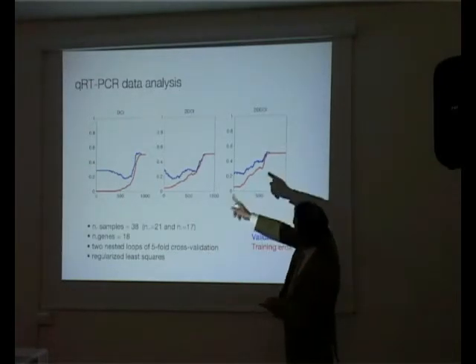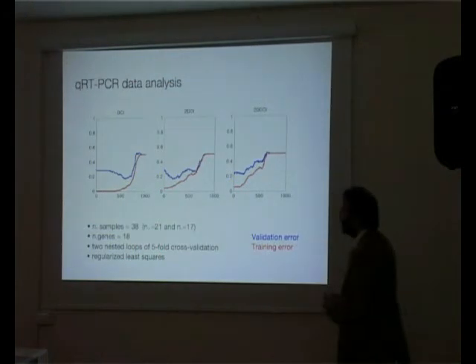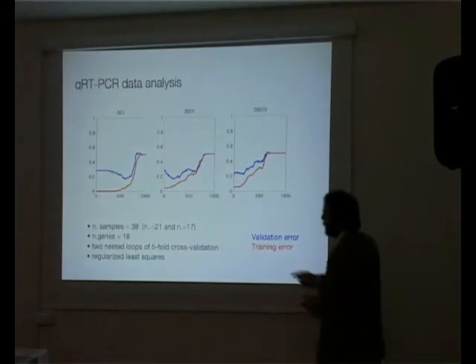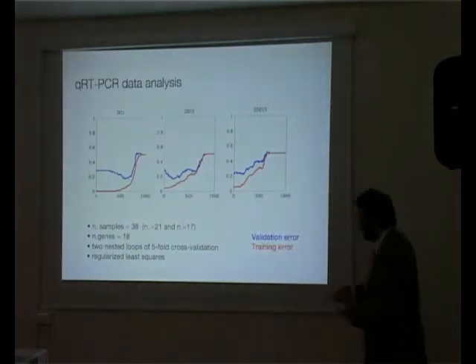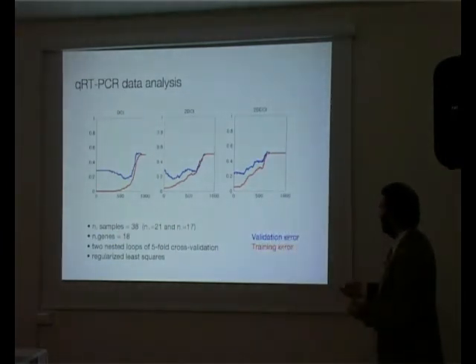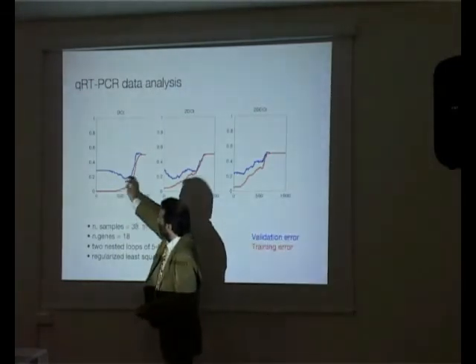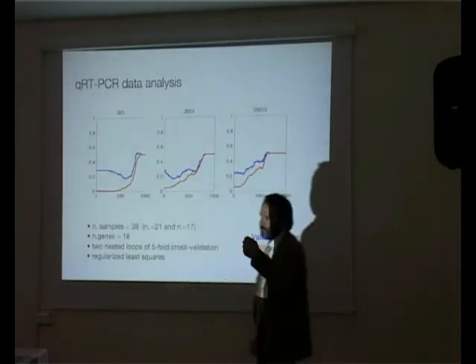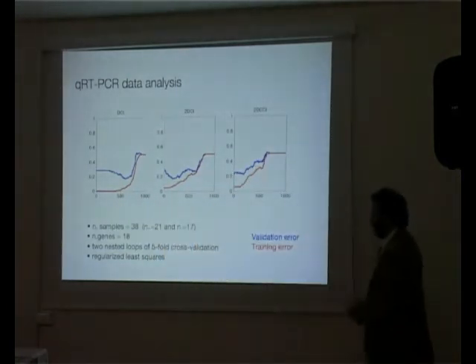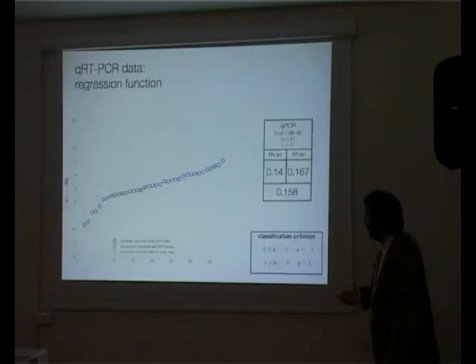And now of the 3 plots we have, the one on the top left was definitely the most promising. What we got here is actually the average of five runs, but this seems to be going in the right direction. And incidentally, around here we will select the value of the parameter we're going to use to try out our system.